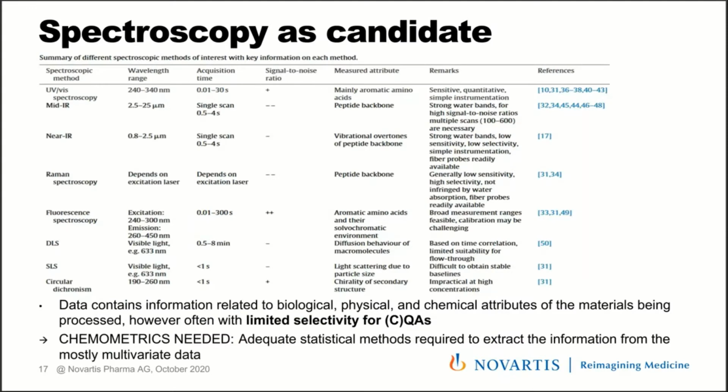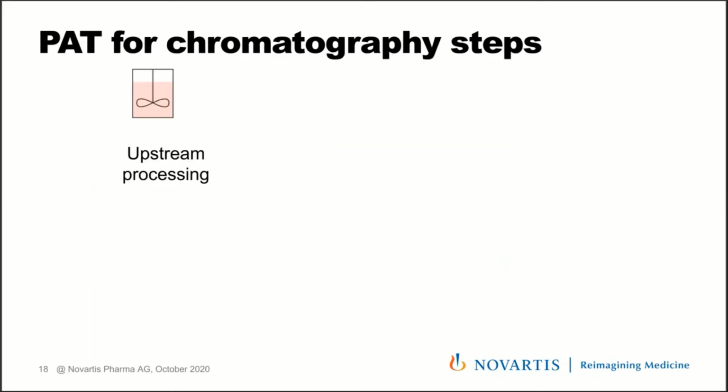When we start with the infrared technologies or UV-Vis technologies, and then compare to the Raman spectroscopy technologies, you can see all the details of your measurement of interest and how far you can go with them. Mostly this part of the techniques is really interesting for us. But the question still remains: is the technology already ready for that?